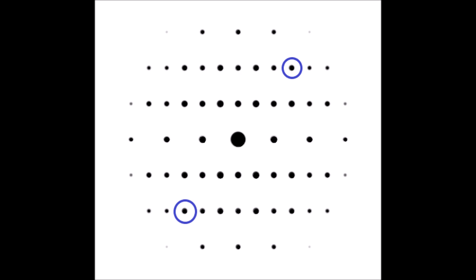Just according to what I see with my eye, but also in a quantitative sense. And again, this is a simulation. We will see some actual real examples here in a minute, but that is how I know that I am aligned with the zone axis.